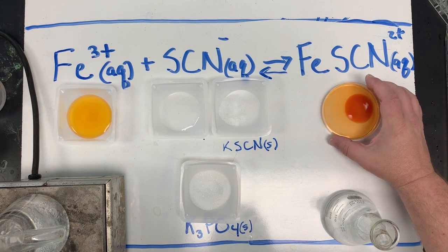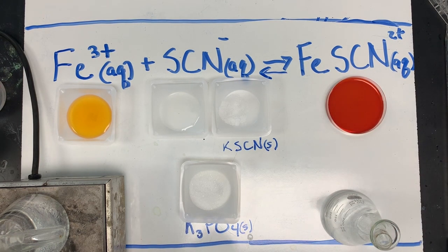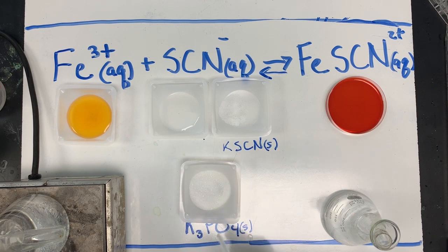Okay, let's go ahead and swirl that one in. We're going to go ahead and add some more chemicals. Now I'm going to take this potassium phosphate. Now potassium phosphate is not found in our reaction, but it will interact with the substances in our reaction.